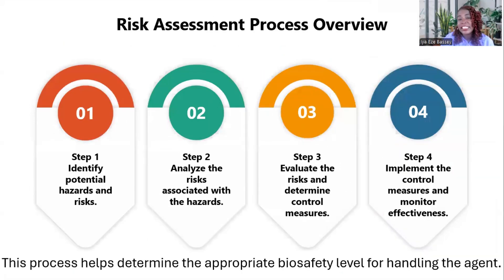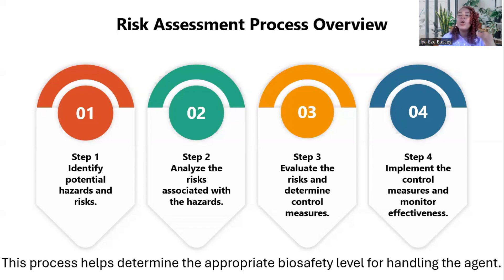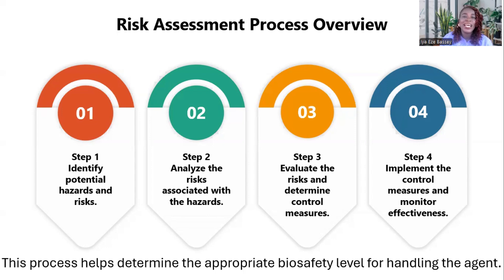What is the risk assessment process overview? Risk assessment is one of the most important parts of bio-risk management. The steps are: first, identify the potential hazards and risks; second, analyze the risks associated with those hazards; third, evaluate the risks and determine control measures; and then implement the control measures and monitor their effectiveness. This process helps identify what biosafety level an agent belongs to and how to handle it.